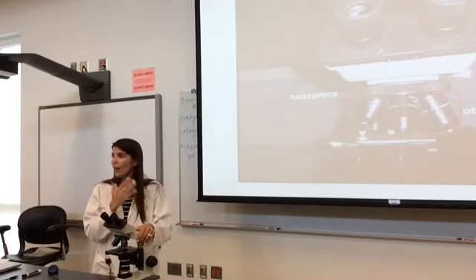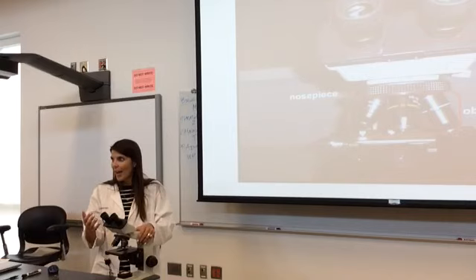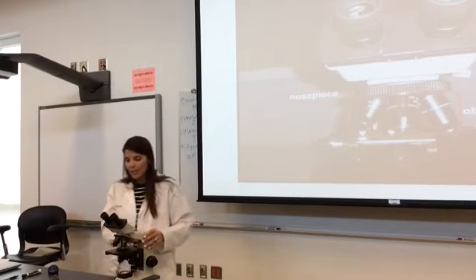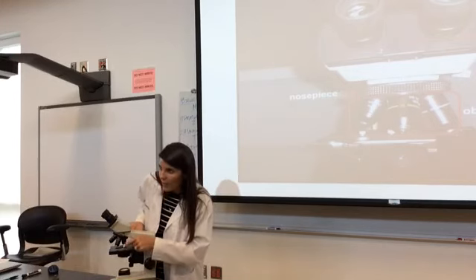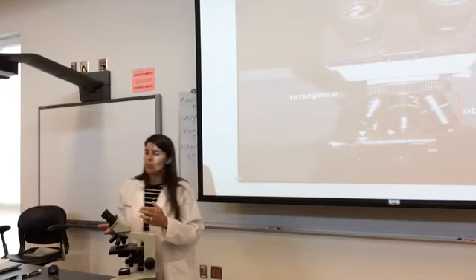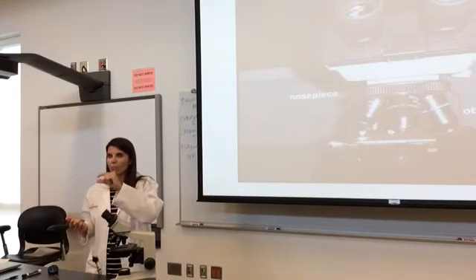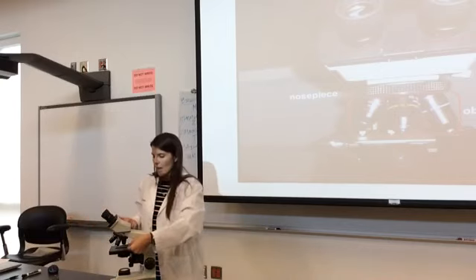This part is not in the notes, but I want you to see what happens because it's on both your lab and lecture exams. And this is just an extra bit of information that will benefit you. So, do you see the distance between where the low power objective is and your stage? So about how much room is that? Like, show me with your fingers. So it's about like this much, right? We call that the working distance.